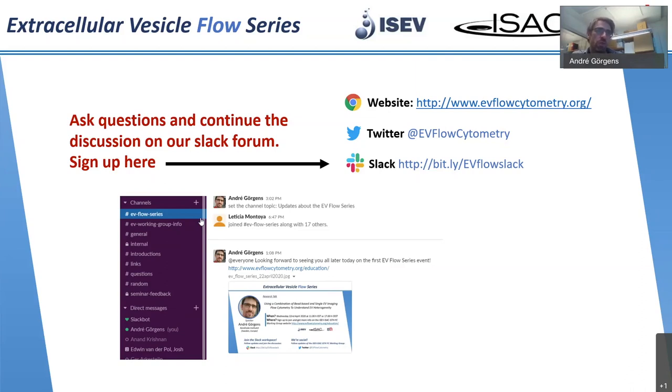And I fully agree with the second question. Of course, we should report data in MESF units and make it more comparable. And it would make total sense to do that. All future data we are generating will be MESF calibrated and reported in absolute units. So that's also an ongoing learning process for us.